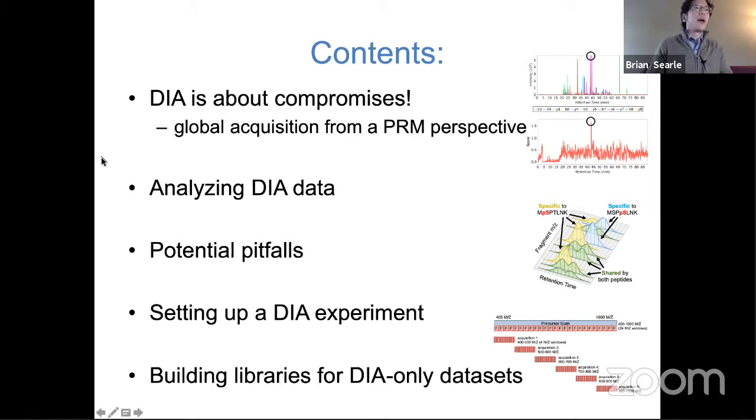Okay, so do we need to use iRT standards in our library-free methods? Actually, no, there's no real reason to use iRT standards in these cases, because using our approach, using the gas phase fractionation, we use all of the peptides as iRTs essentially. So we do a fitting first without any knowledge of retention time, using these essentially retention time free strategies. And then we use retention time as a correction after the fact to choose different sorts of peptides in those particular cases.